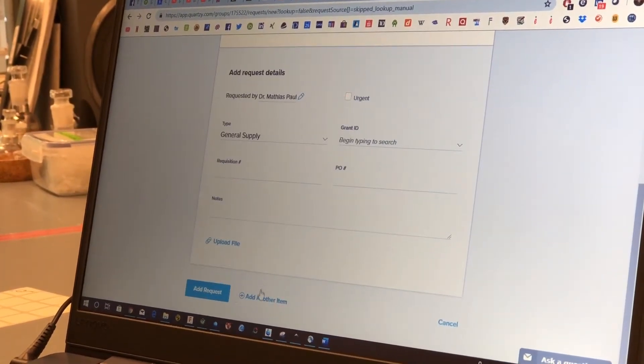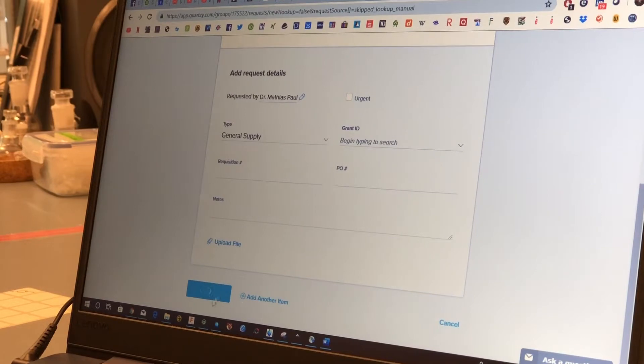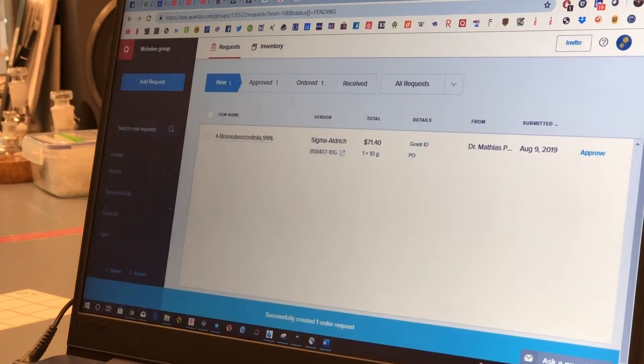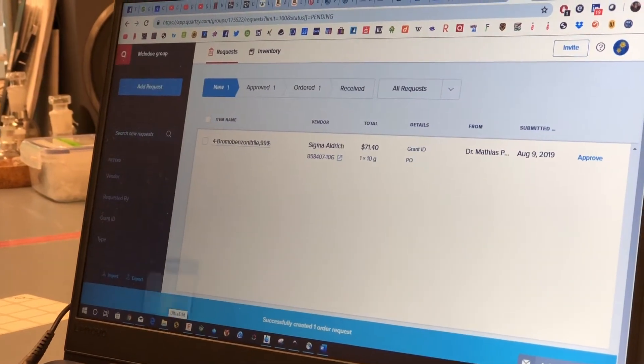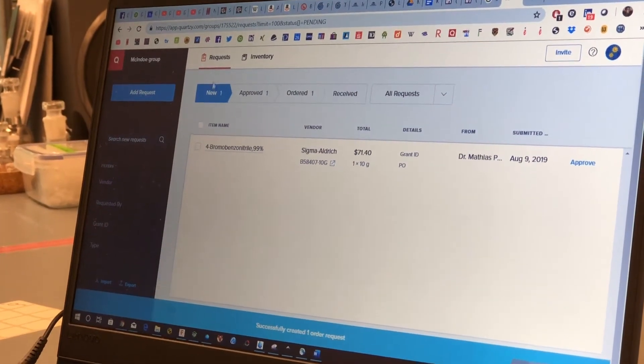And that's it. You add the request and it is under new requests.